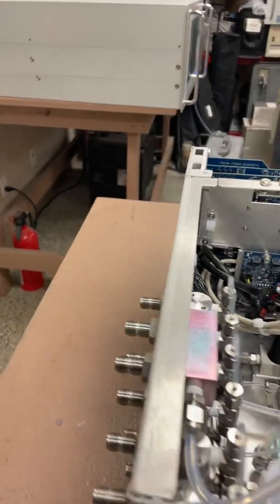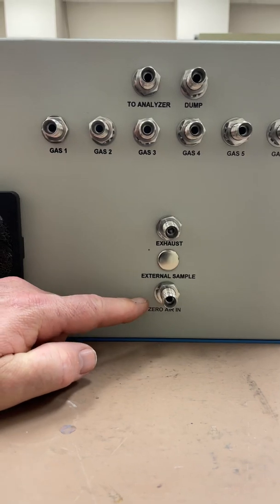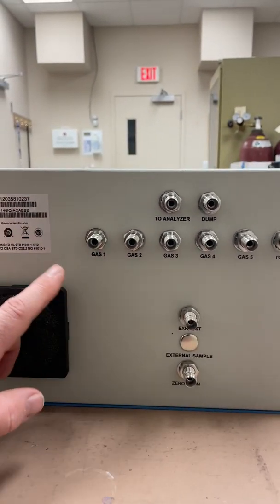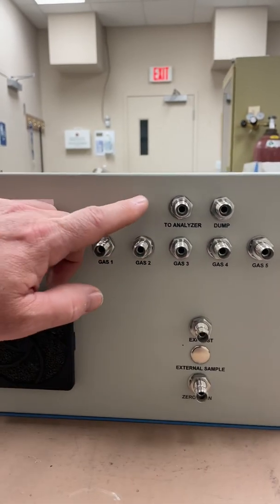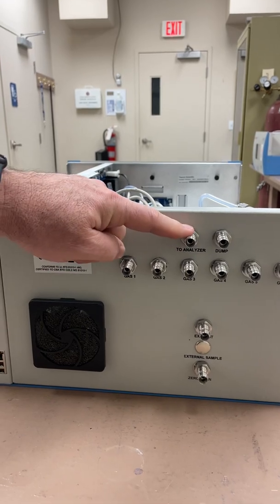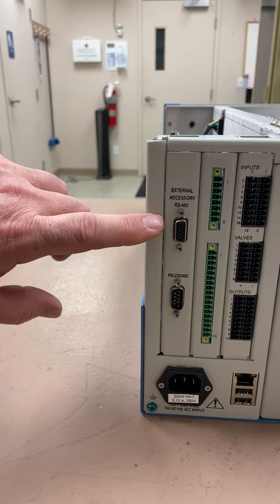Coming around the back of this unit you can see where all the ports are set up. Starting at the bottom, this is where the zero air generator connects, pushing in about 35 psi of clean contaminant-free air for your dilution air. Up here is an exhaust, and then you can see all the gas ports from one through six where you can connect your cylinders — SO2, H2S, NOx, methane, CO, CO2, and so on. There's an analyzer output port here and an atmospheric bypass dump so you're not over-pressuring the analyzer with your output gas.